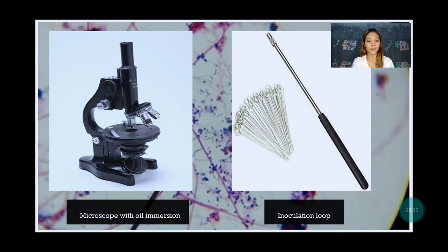Lastly are the inoculation loops, a tool usually made of platinum or nichrome wire. This tool is handy for use in inoculation or cultivation of microorganisms, as it can be easily sterilized over a flame when transferring microorganisms, consequently preventing or reducing chances of cross-contamination.